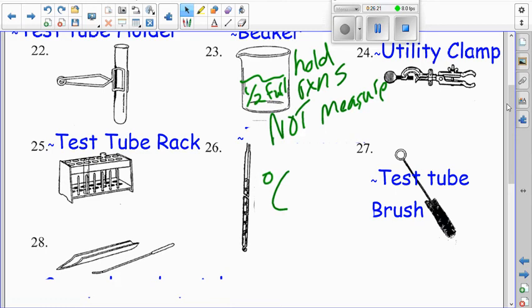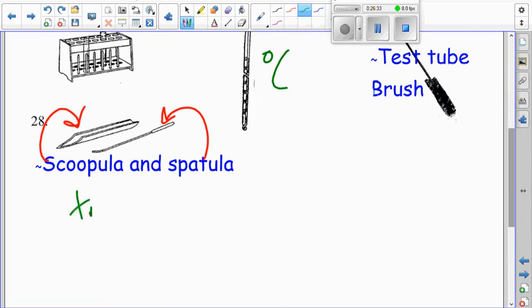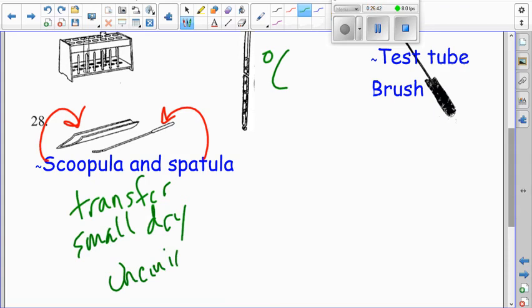And lastly, we have the scoopula and the spatula. The scoopula is that guy. The spatula is that guy. Those two are both used to move, or transfer, small, dry chemicals. Okay, that's all they're used for. Here's what they look like. The scoopula has a nice little scoop shape to it. You can use this to get a few grams of something. The spatula is flat, the flat spatula. It's used for really tiny amounts. So you just get a little tiny amount and just tap, tap, tap, that kind of thing.